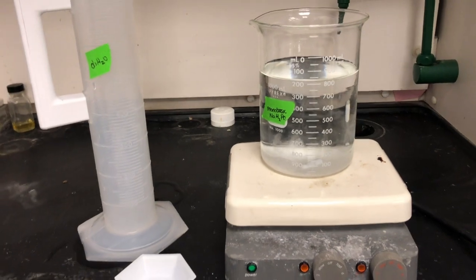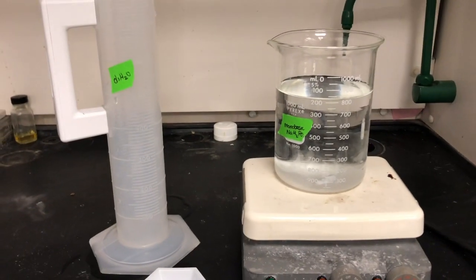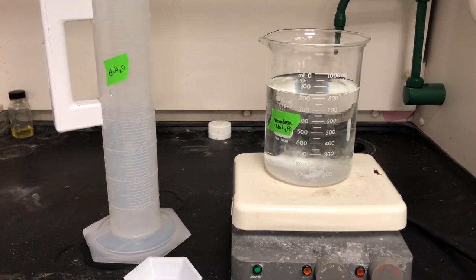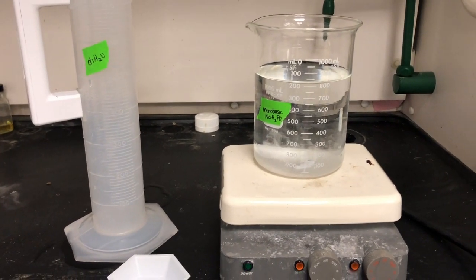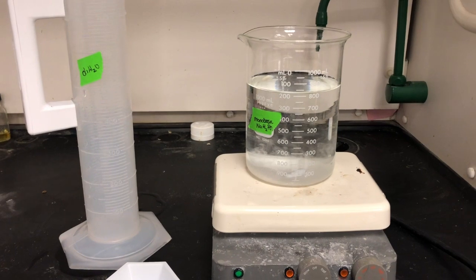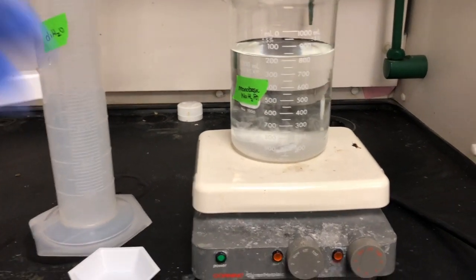You're going to put it in a beaker along with about 800 milliliters of DI water, and you're going to create a vortex within the solution to evenly mix the solution.